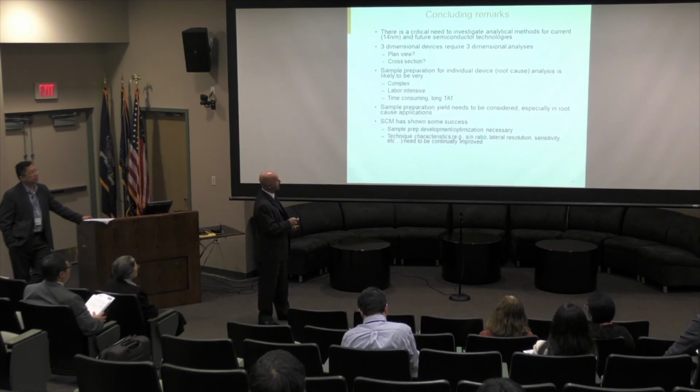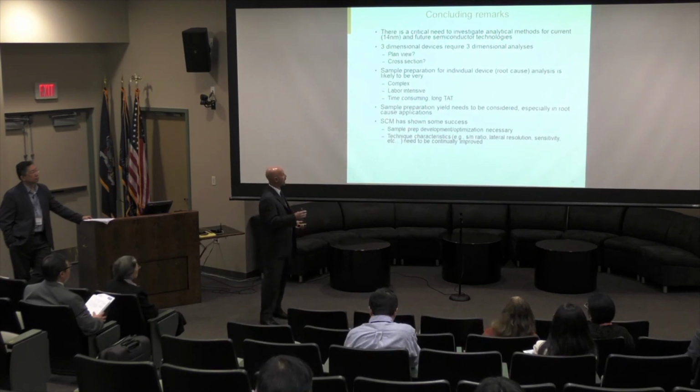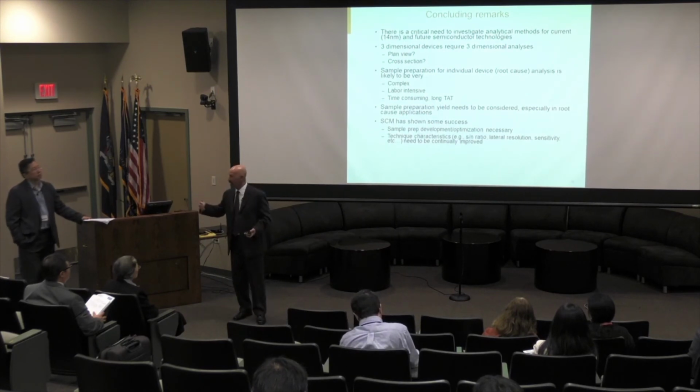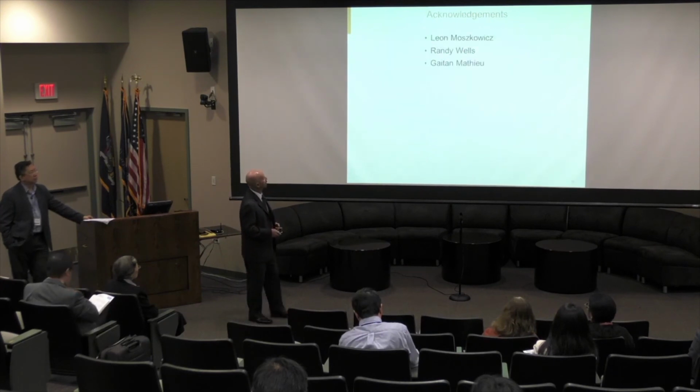Sample prep yield needs to be considered. And then on my last example there, SCM has shown success, but like I said, there's a lot of development and optimization work necessary to make it a very usable process.